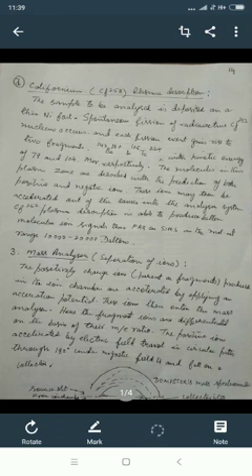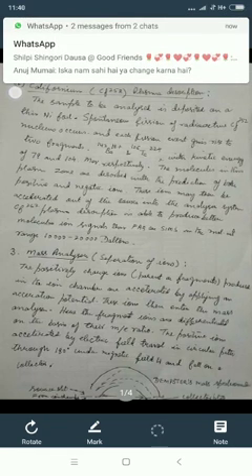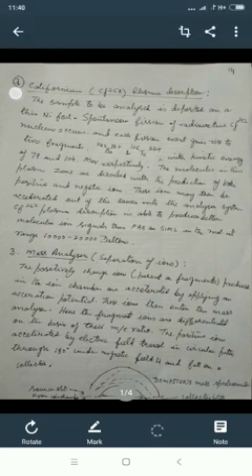respectively. The molecules in the two plasma zones are desorbed with the production of both positive and negative ions. These ions may then be extracted out of the source into the analyzer system. Cf-252 plasma desorption is able to produce better molecular ion signals than FAB, fast atom bombardment, and SIMS, that is secondary ion mass spectroscopy, in the molecular weight range of 10,000 to 20,000 daltons.